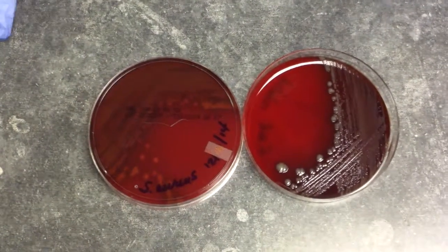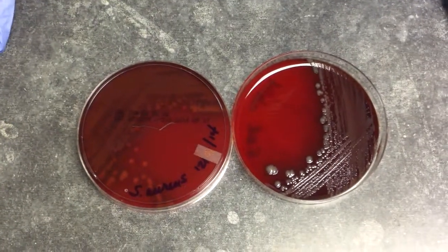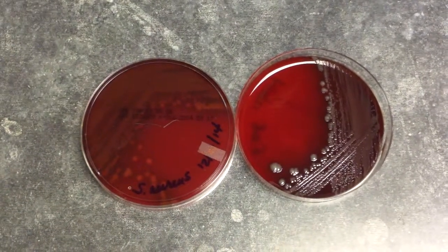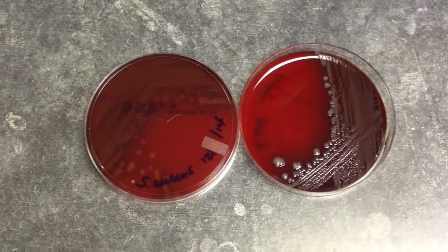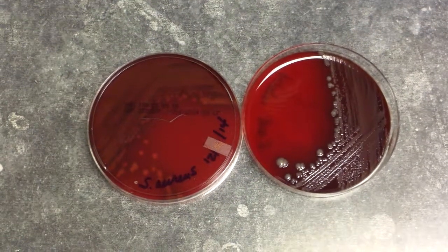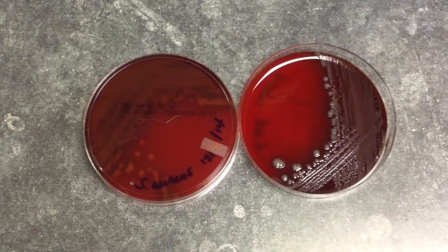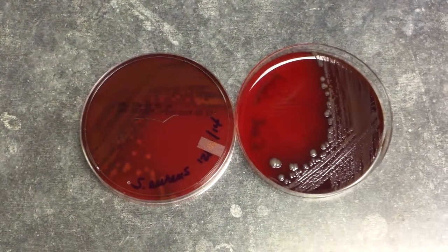In microbiology lab, we have hundreds of different types of media that we use to isolate and identify bacteria. These media can be classified into different groups: non-selective, selective, differential, and enrichment or enhancement media.